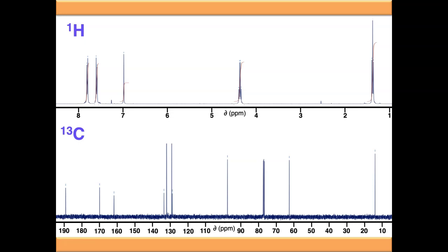These effects can explain some of the things you may have noticed in the spectra I've been showing you so far, like these signals shown in blue and red. What these are is the solvent we're running the NMR spectrum in, and in this case it's deuterated chloroform or CDCl3. When we make deuterated chloroform, there is a small amount of protic chloroform in it—generally around 99.8% deuterium and 0.2% proton. The reason we use deuterated NMR solvents is so that the proton signal doesn't show up in the proton spectrum, because otherwise it would drown everything else out since the solvent is in vast excess over your sample. But this little impurity of protic chloroform is what gives you the NMR signal over here. So you can actually see the signal for chloroform in your proton NMR spectrum due to that little impurity.